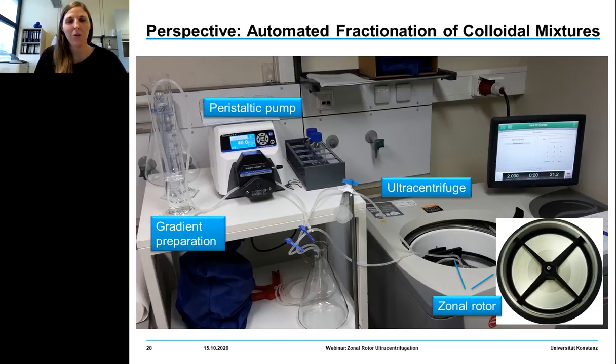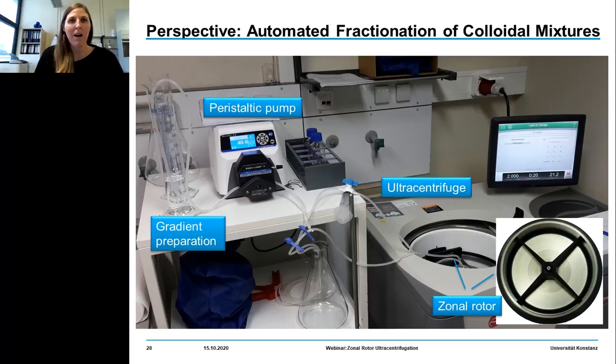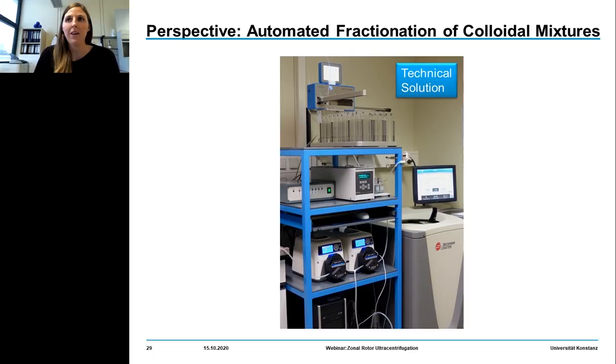This is a view of our lab when we started with zonal rotor centrifugation. Here you can see the most simple setup: we just need several graduated beakers for the gradient preparation and a peristaltic pump for the loading and unloading process, along with the zonal rotor and the core which is placed in the rotor bowl.